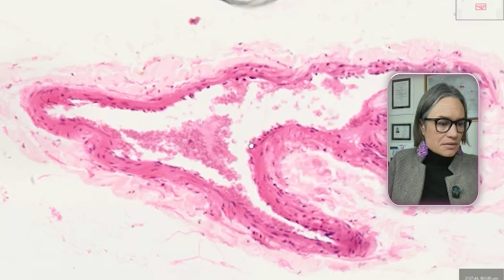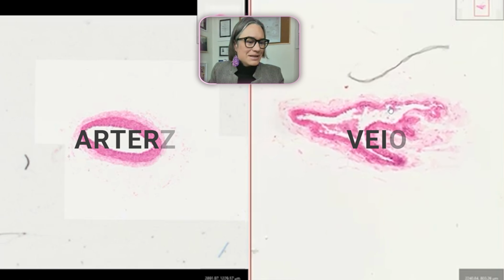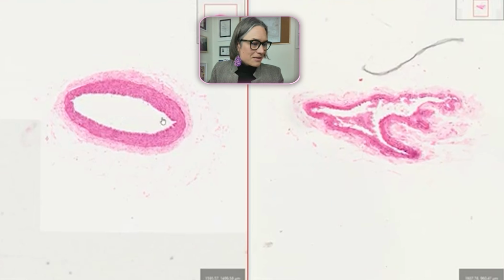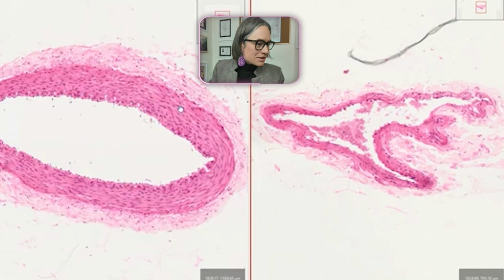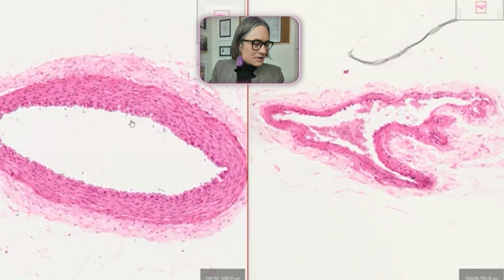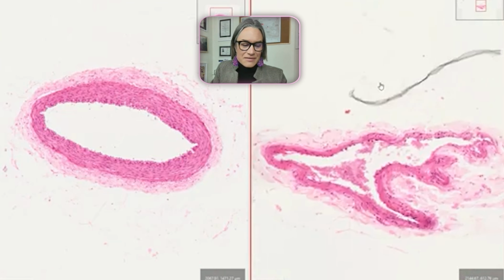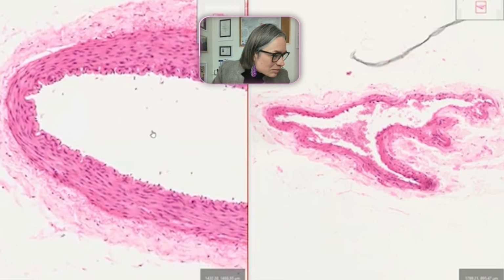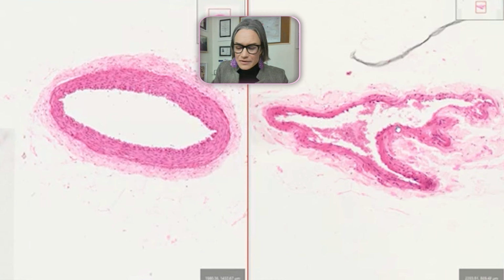Yeah, basically irregular. Erythrocytes inside give us a big clue. How cool is that? Super obvious, right? Kind of as if we were inflating this one and stretching, and as if it would go to the gym to have more muscle, but obviously this is smooth muscle, so this is not anything we can increase in the gym, but let's just have this mental shortcut to remember how an artery versus a vein looks. And do we have any red blood cells in this one? Maybe some random one, but in the vein you can see very nicely.